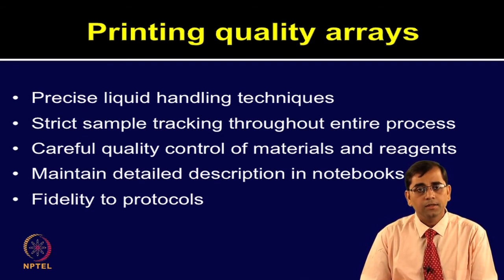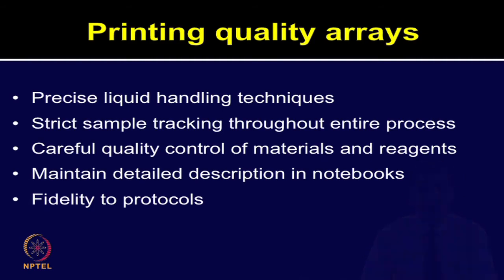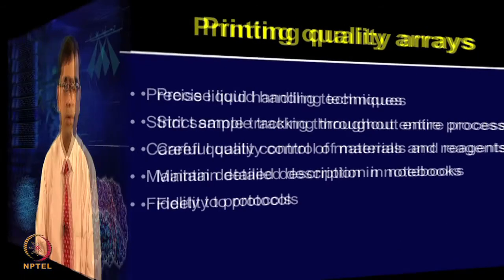It is a good idea to build a detailed log history for each step, from cloning, DNA preparation, printing, etc. Now, if you have done this step by step optimization and evaluation, there is less chance of making any errors, because in high throughput approaches, when we are dealing with thousands of features, it becomes important to track everything throughout the experiment and make note of the details.